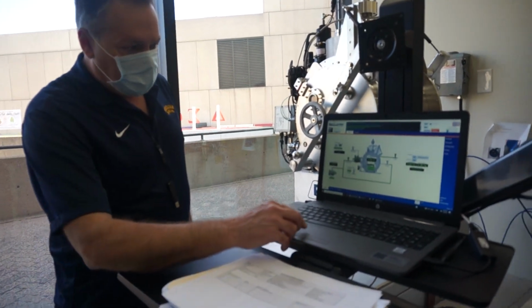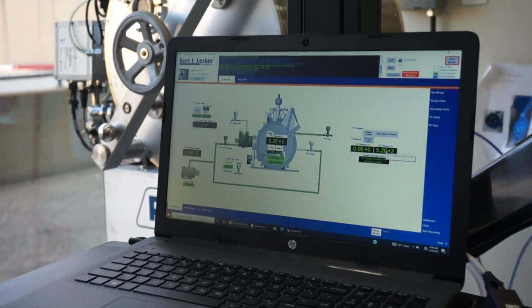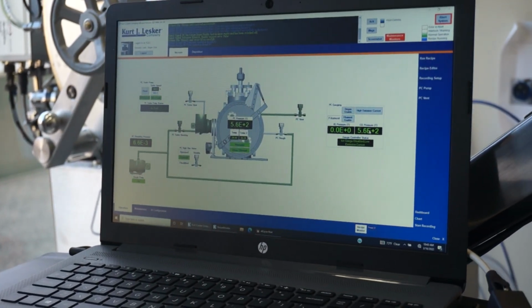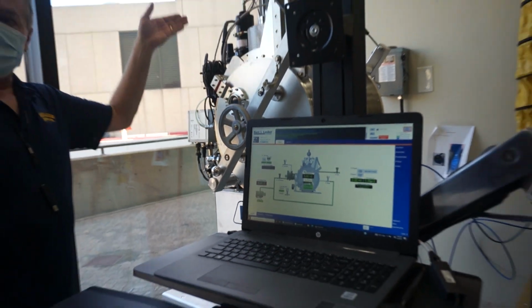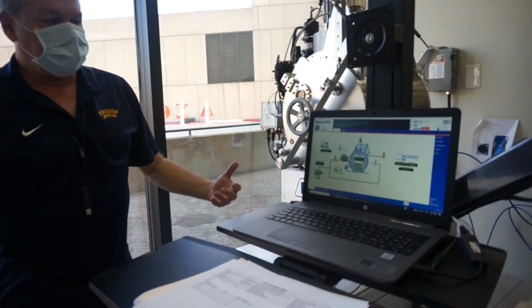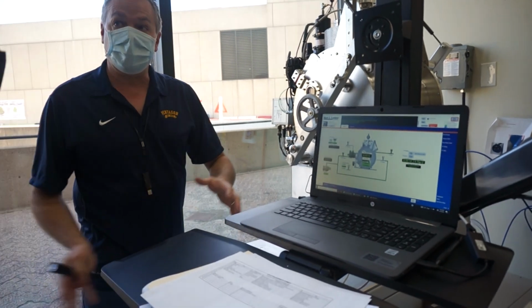But what I wanted to point out is, these are both displayed within here. So we have in our software what we call a series of conditions. Based upon the state of something, in this case the state of the isolation valve, the high vac valve, it's either going to read from the convection gauge, or if the conditions are right, it'll read from the ion gauge.